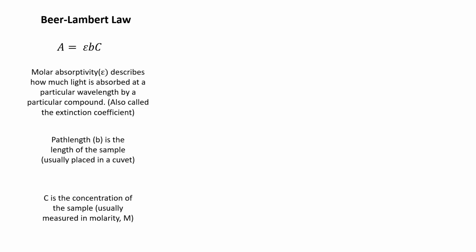Okay, now we're finally going to actually talk about the Beer-Lambert law, again, sometimes just called Beer's law. So here it is mathematically. Absorbance equals molar absorptivity times path length times concentration. Okay, let's break this down just a little bit.